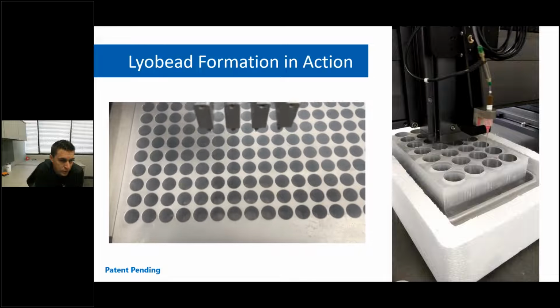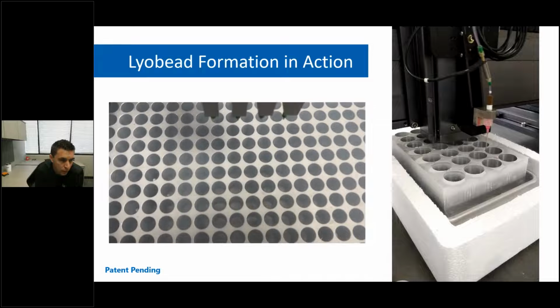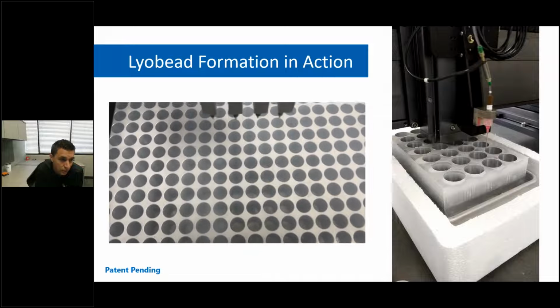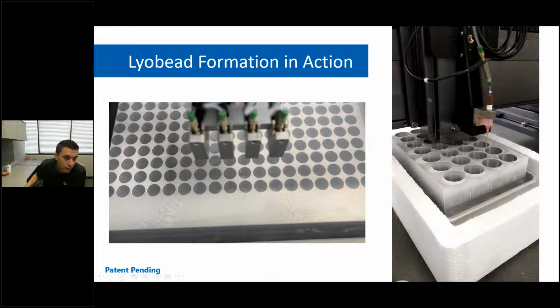And then once the freeze time is achieved, they will freeze and then drop. So we don't see that yet in this video, but that's what happens during the process. So kind of fun. Fun to see these beads in real life. It's an interesting process to watch.